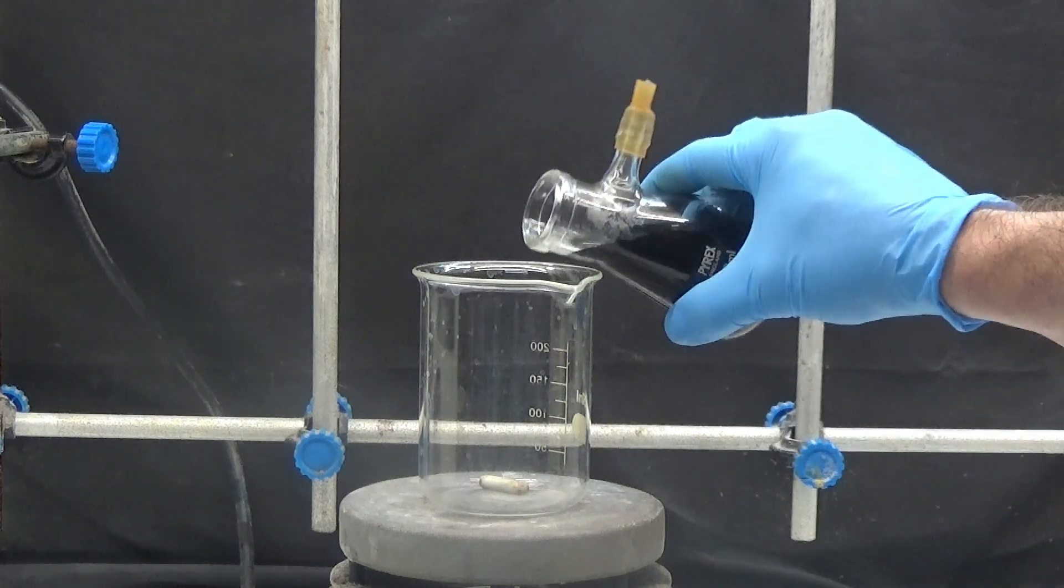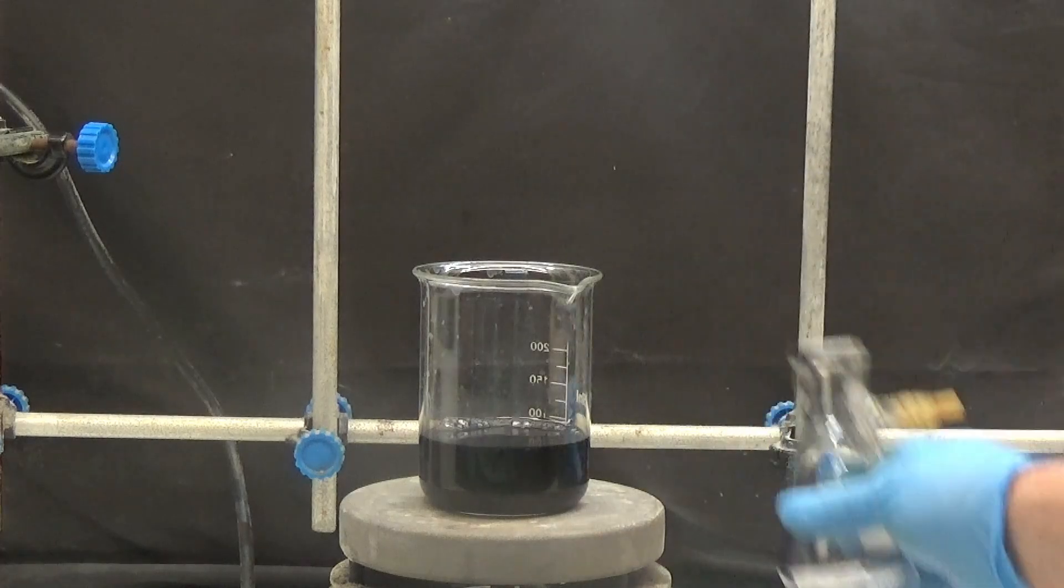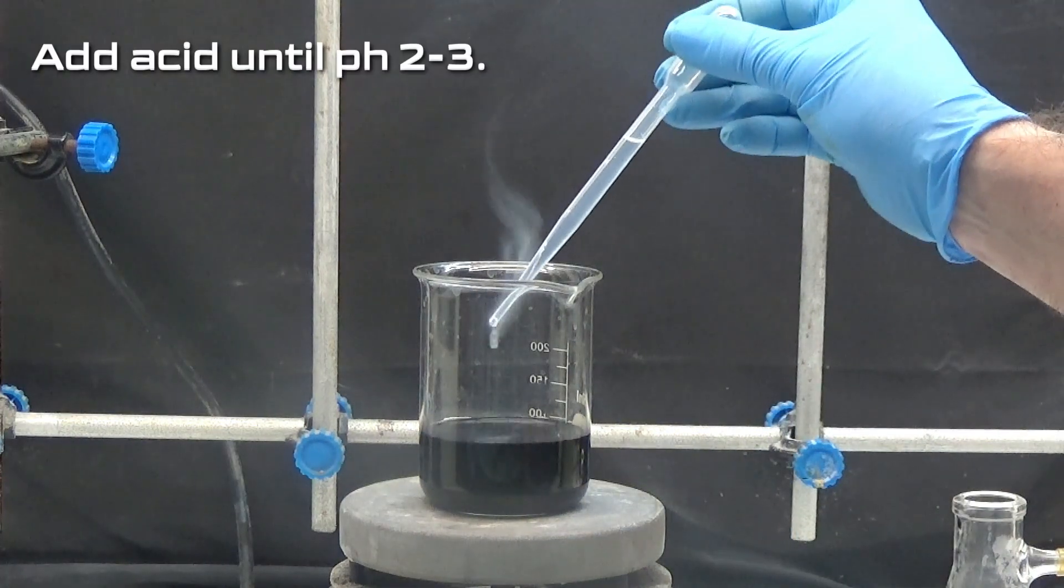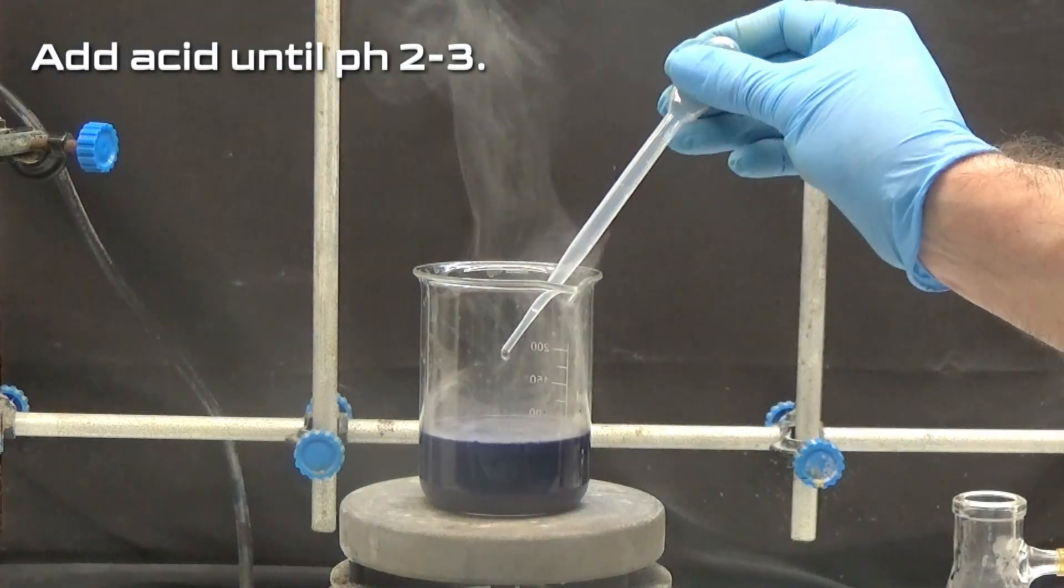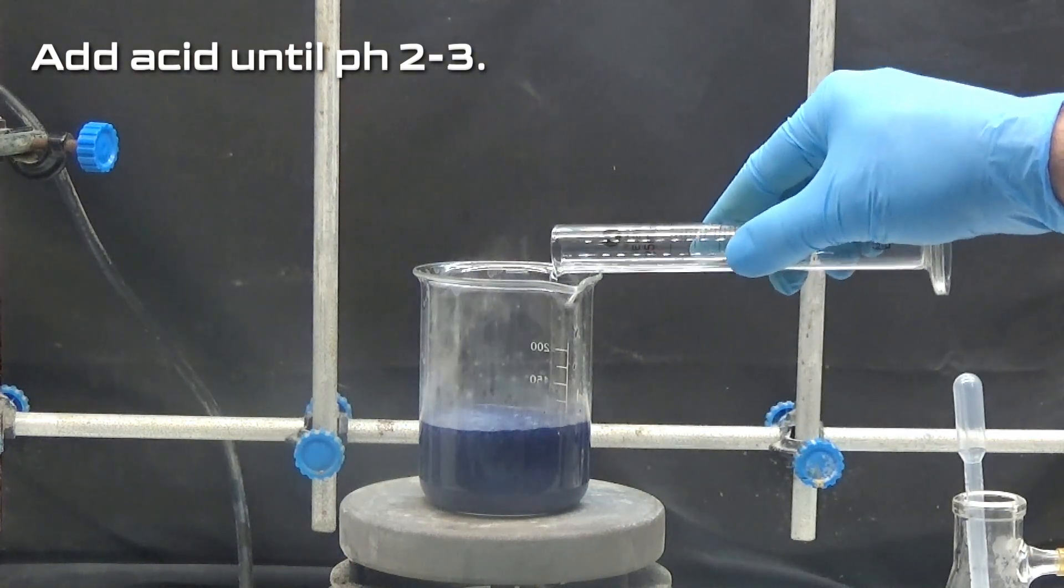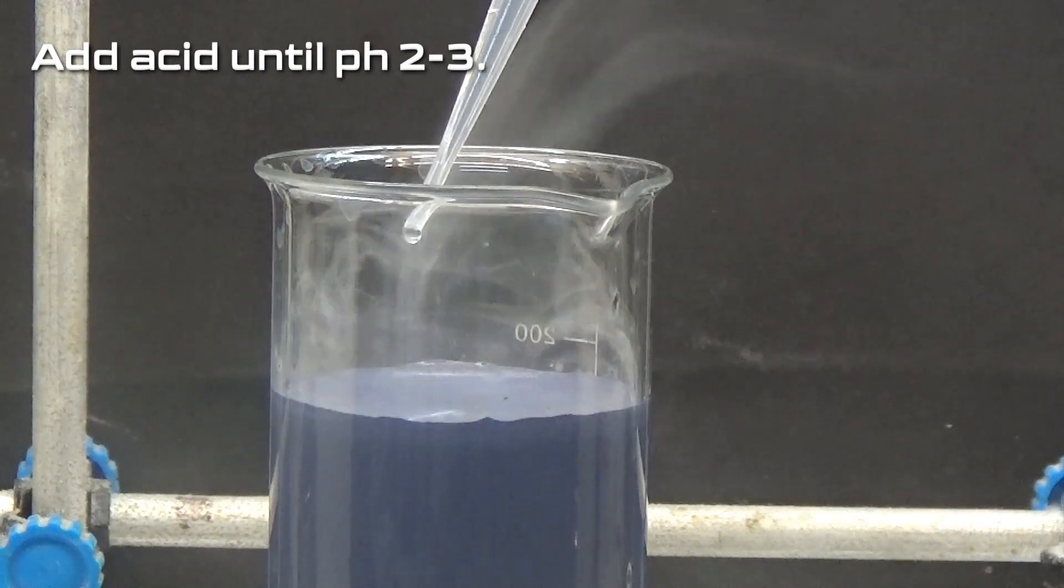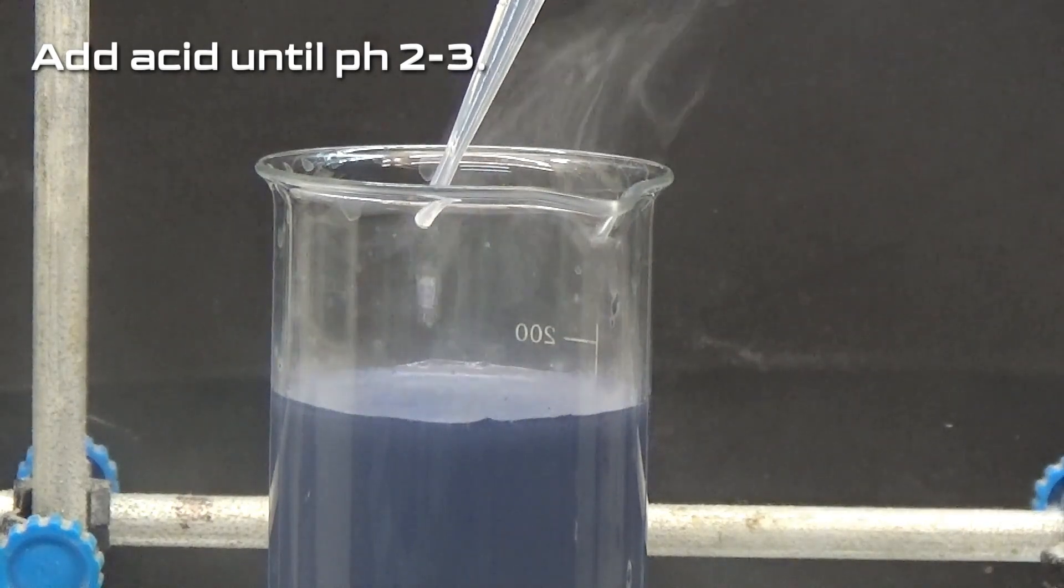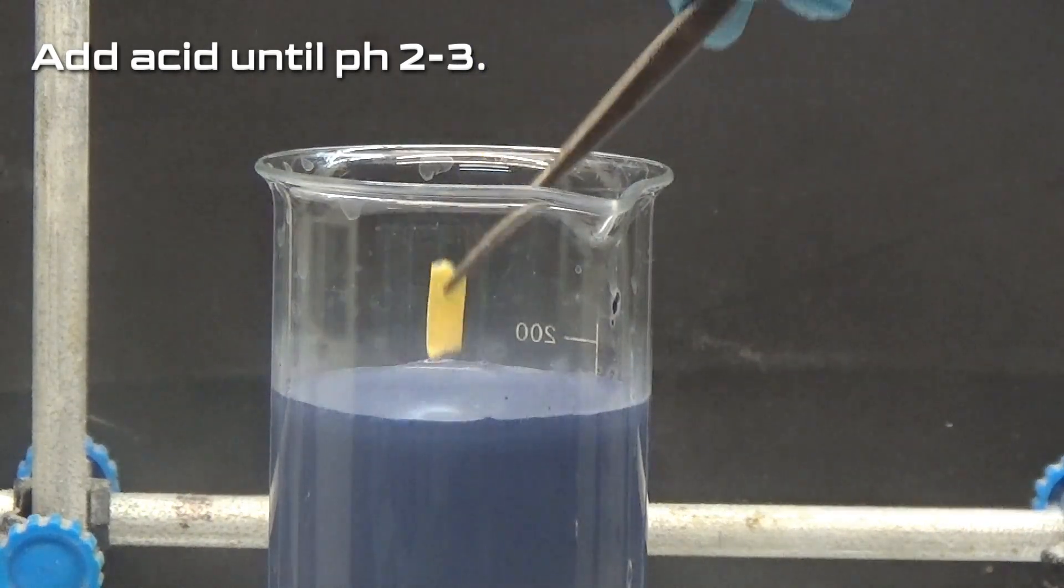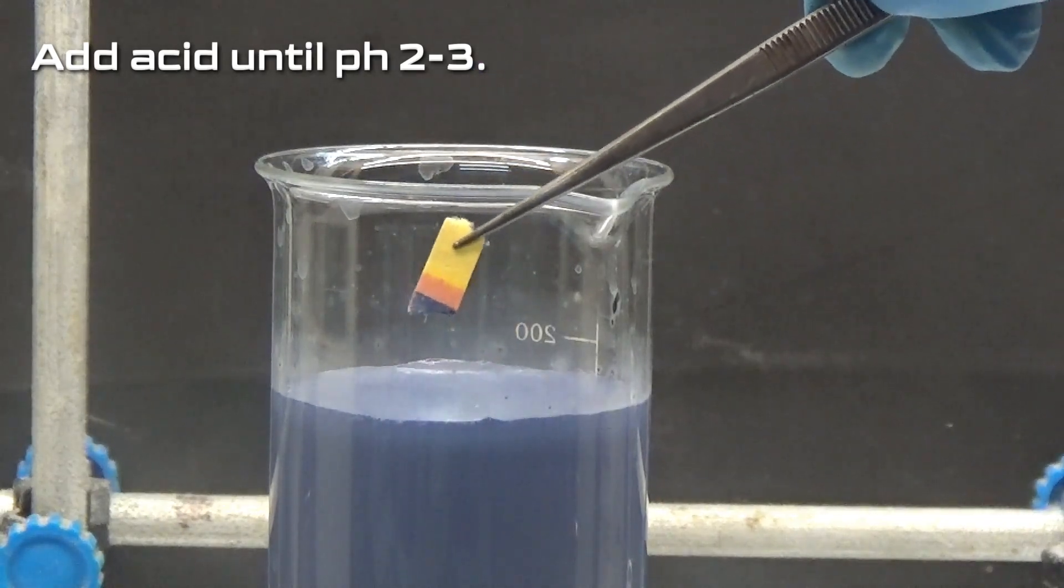The filtrate is put in a 250 milliliters beaker and concentrated hydrochloric acid is added slowly with stirring. We add small quantities of water to avoid that the precipitated acid thickens. We add acid until pH 2 or 3, verified with pH reagent paper.